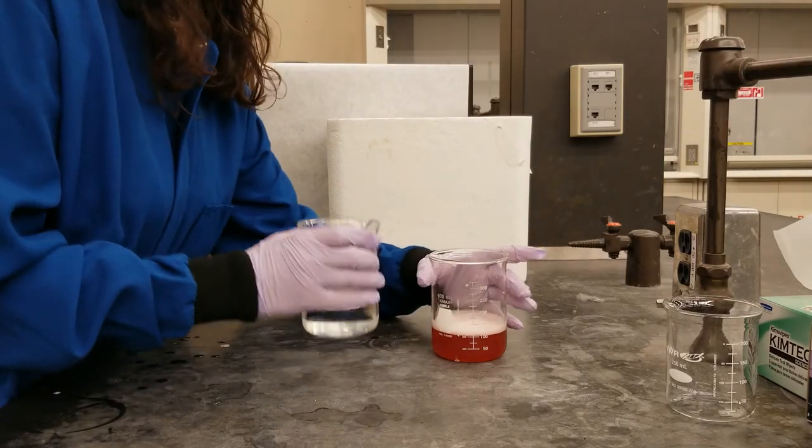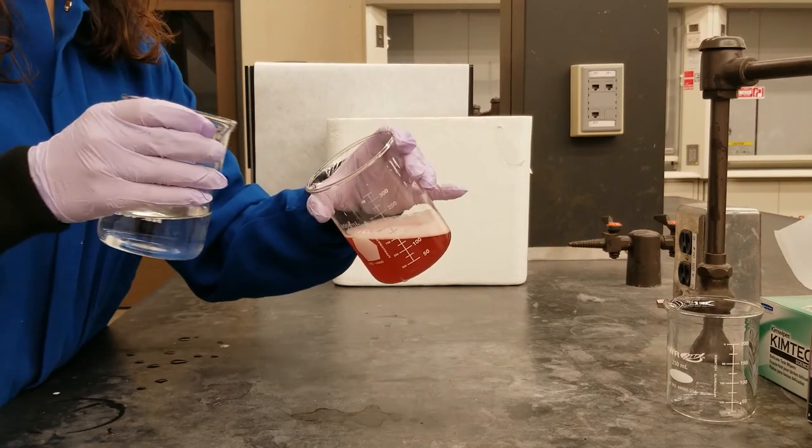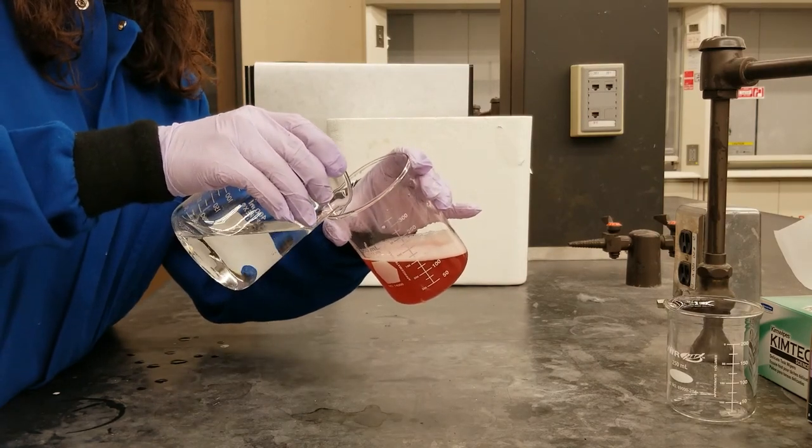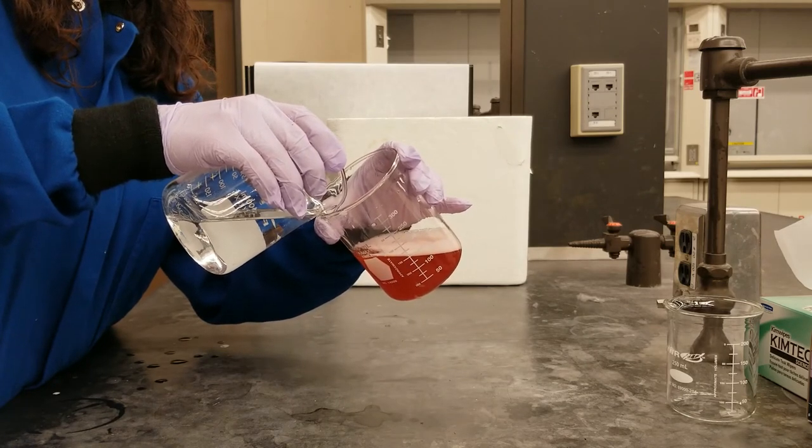We'll then take our isopropanol and slowly pour it along the edge of the beaker, being very careful to not disturb the layer of strawberry underneath.